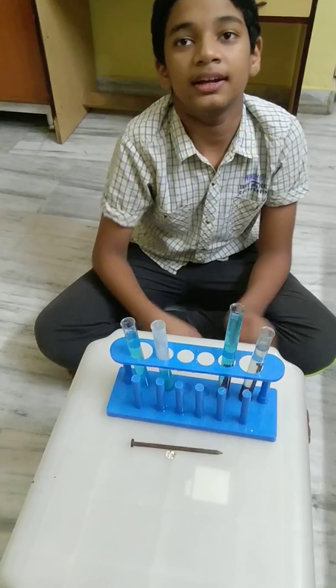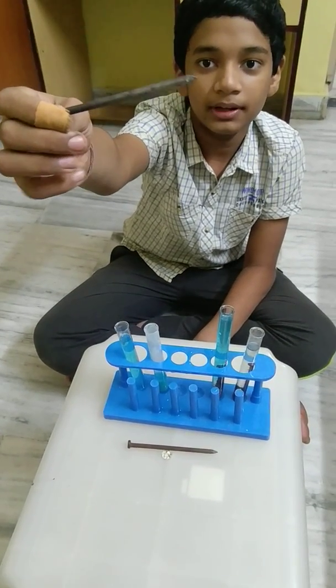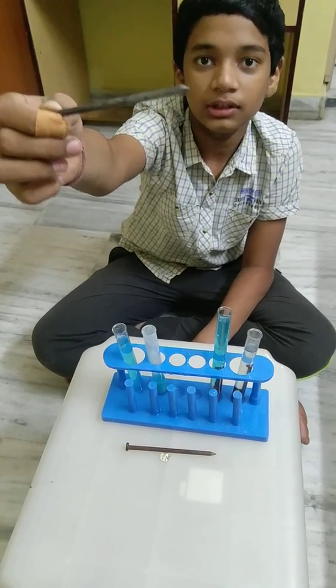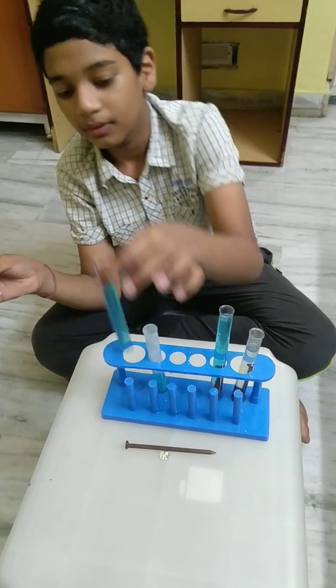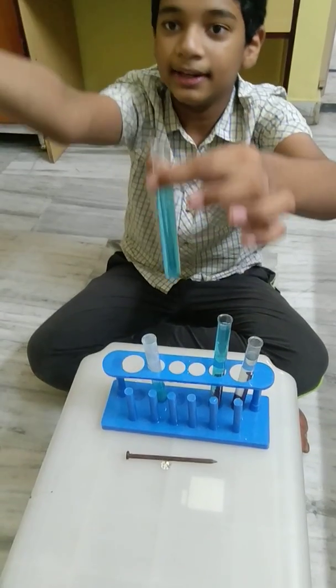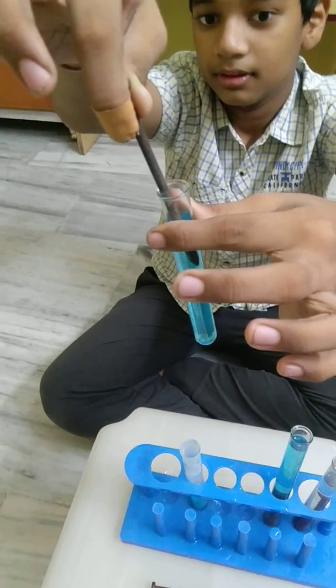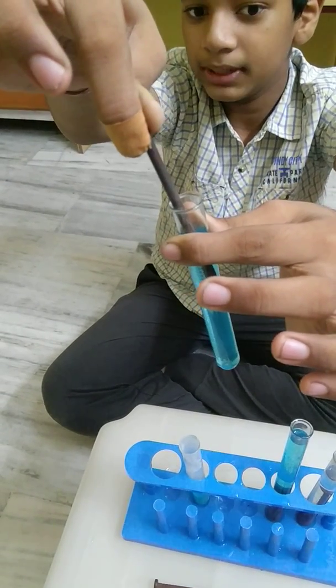So, let's get started with our experiment. As you can see, this nail is completely normal in colour as usual. When I take this copper sulphate solution and dip the nail, observe carefully and let it be there for 20 seconds.